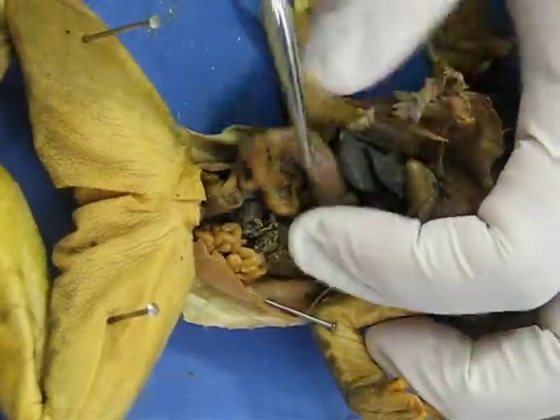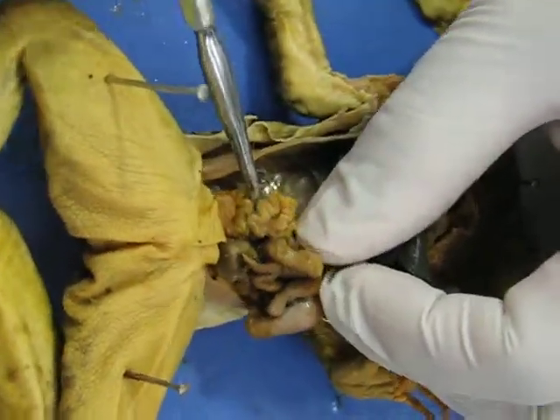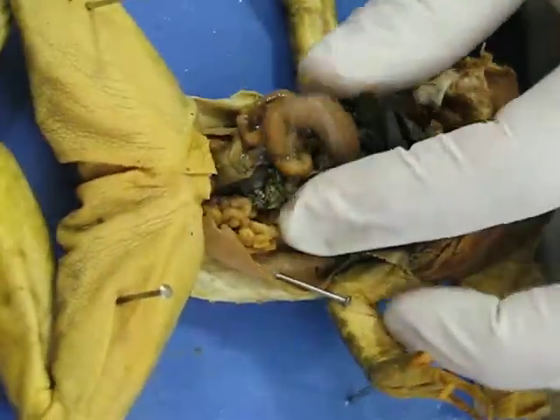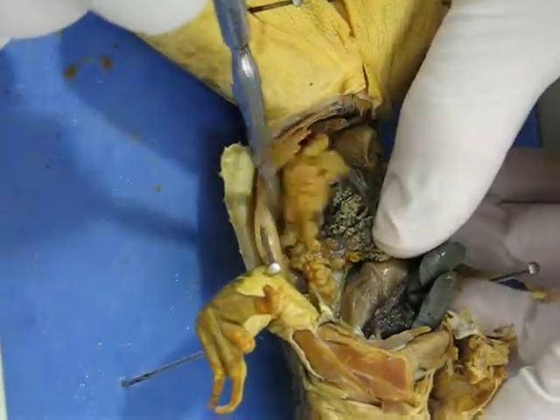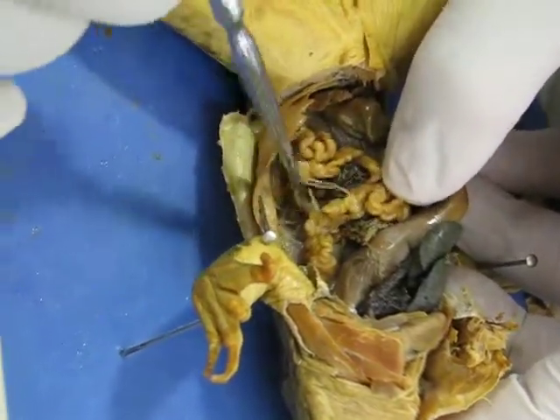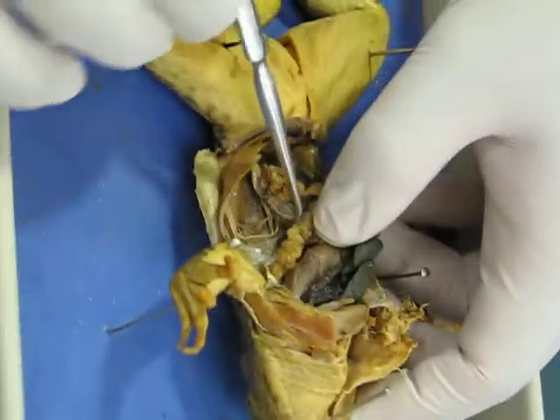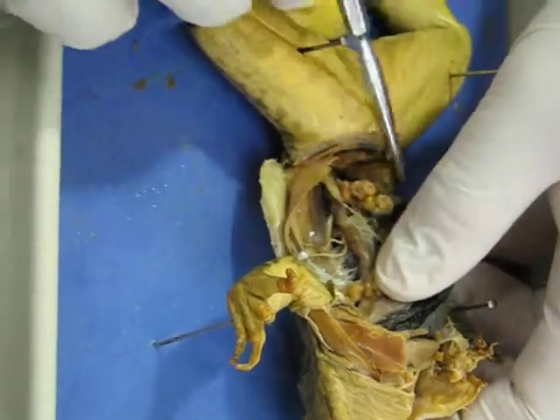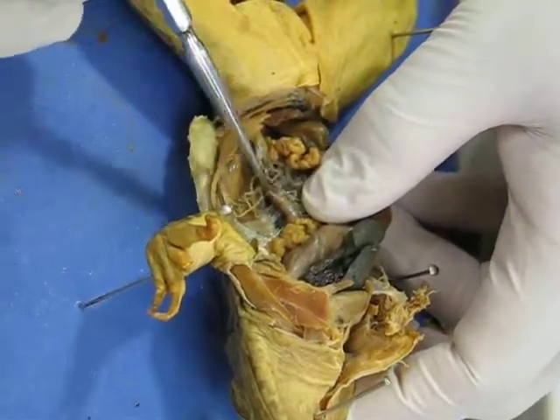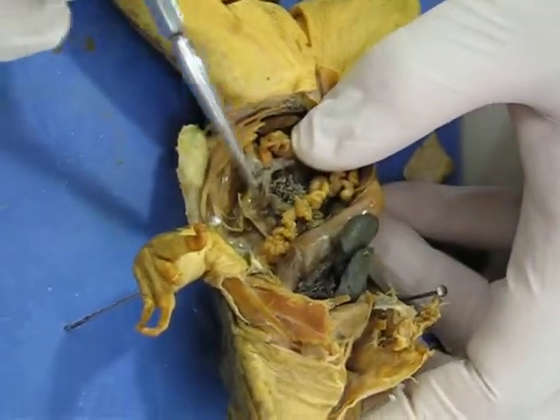The last structure that we want you to know is up and underneath. It's showing up better on the other side, so I'll pull this back. If you pull all this out, you can see there's a brown structure that runs along the back wall, and that is actually a kidney. That kidney often is a little bit darker brown than that, but that is the kidney.